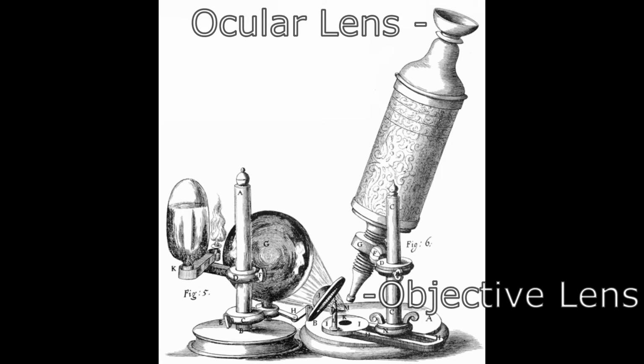The first compound microscopes, like the one used here by Sir Robert Hooke, represented the cutting-edge technology available at the time. The biggest reason why these microscopes weren't very powerful is because the way the lenses were made lacked the precision to make images with high resolution. With today's manufacturing processes, lenses can be made with high precision with a relatively inexpensive cost associated with them.